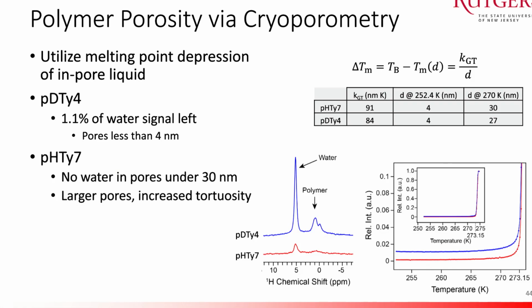So we definitely have multiple water populations. This is like the in-pore waters. There's a bulk water signal that goes away at the normal water freezing temperature here at 273. They wanted to understand if this water would ever freeze. And so this actual NMR tube was in liquid nitrogen prior to going into the magnet. The facility manager wasn't thrilled when he found out about that. So we froze that. We took that really cold before putting it into the magnet, and that peak never went away. So as to whether or not it's exchanging, yeah, I don't know if that answers your question.